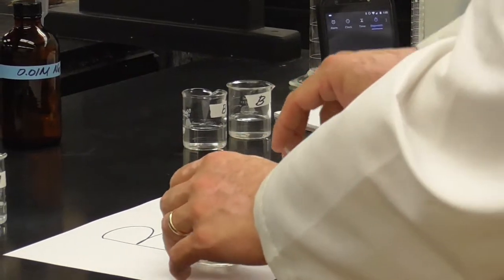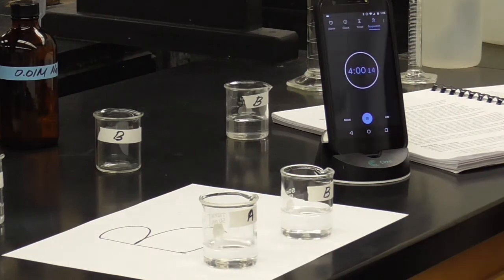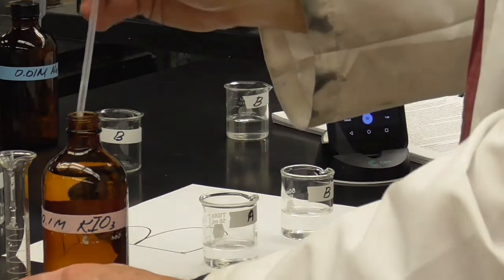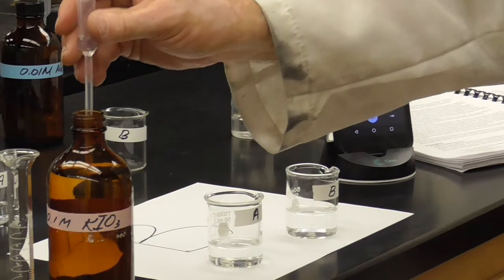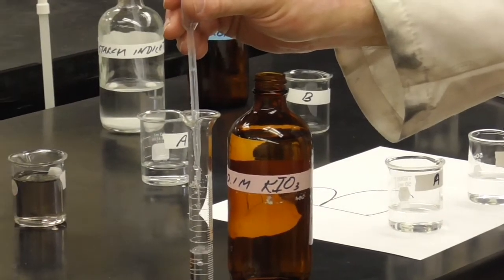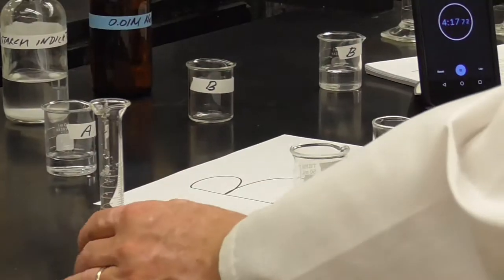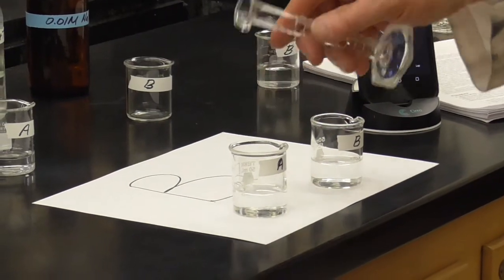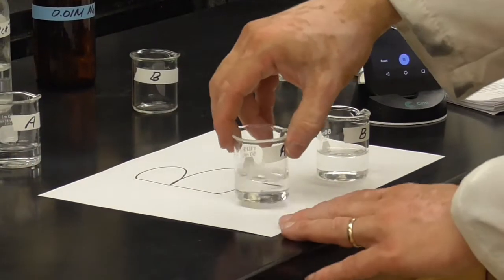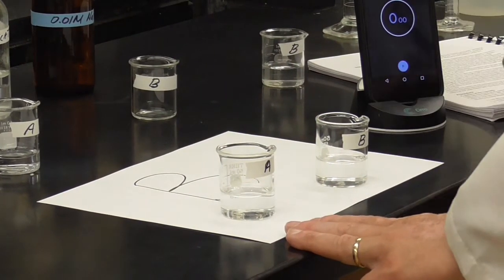All right, let's do the same thing. This time, trial 2. And this time, we're going to put 4 milliliters in. So twice as much, twice as much of the iodate. Mix that up. Start my timer, reset that.